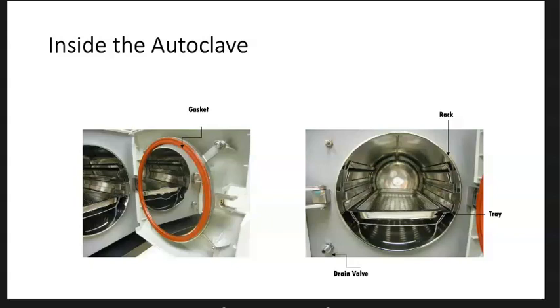The PSI for sterilizing has been ensured for a single thickness pack. So if you can imagine stuffing 6 surgery packs into this autoclave, it will likely cause compromise to your patient and the center of your packs will not be sterilized.